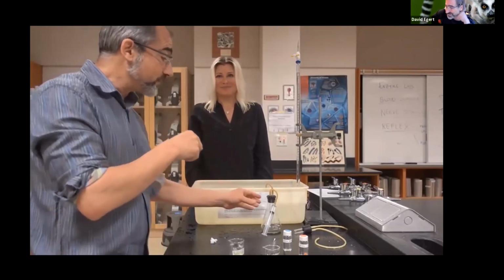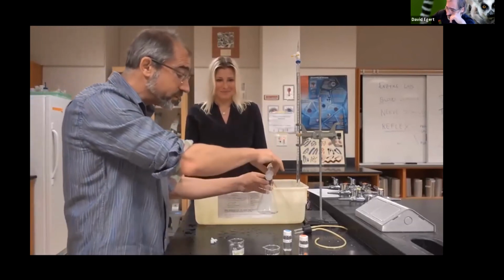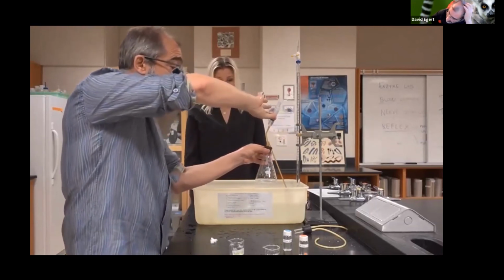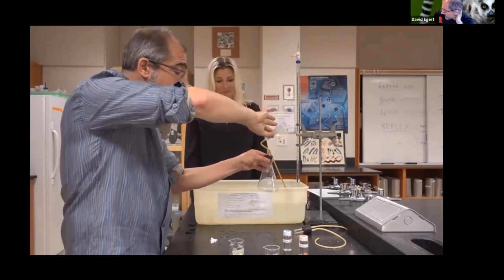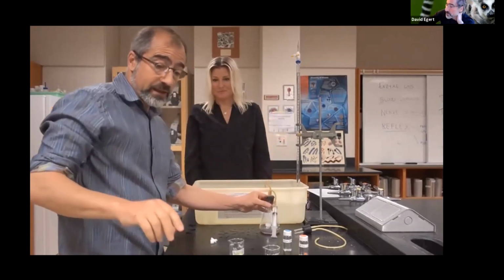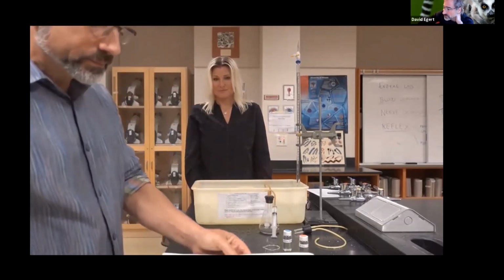And you'll also have the reaction master person that'll be injecting, mixing the substrate and the enzyme and keeping it agitated for the whole duration. And then there'll be the person recording the data.